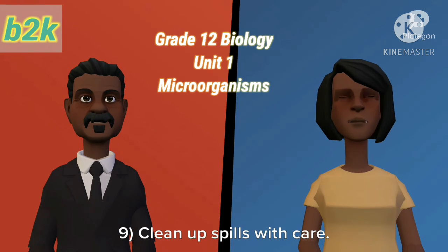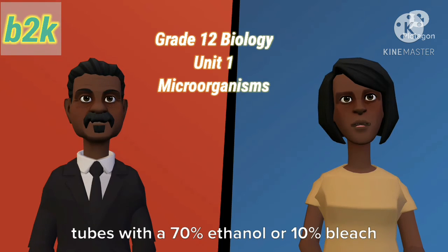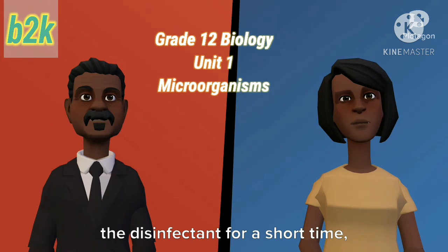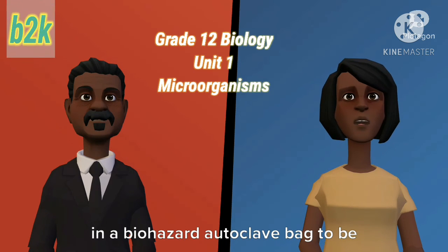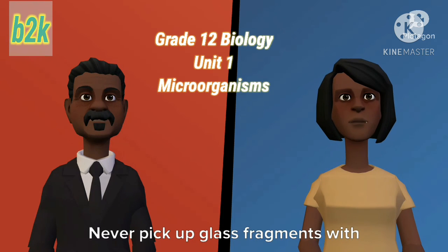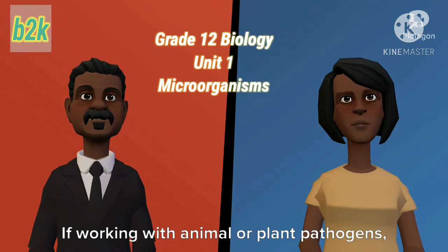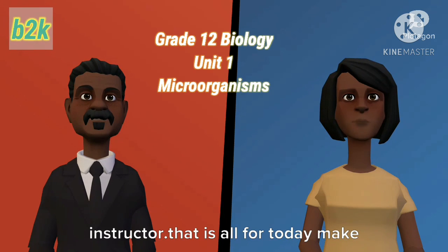9. Clean up spills with care. Cover any spills or broken culture tubes with a 70% ethanol or 10% bleach solution, then cover with paper towels. After allowing the spill to sit with the disinfectant for a short time, carefully clean up and place the materials in a biohazard autoclave bag to be autoclaved. Wash the area again with disinfectant. Never pick up glass fragments with your fingers or stick your fingers into the culture itself. Instead, use a brush and dustpan. If working with animal or plant pathogens, keep the area clear and notify your instructor.